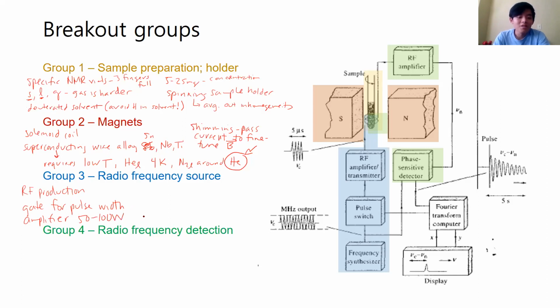I mean, the width of the pulses kind of corresponds to the range of frequencies if we Fourier transform that square wave. So I guess if we have narrower pulses, that corresponds to a wider range of frequencies. Yeah, I don't know if anyone else in the group wants to add stuff.